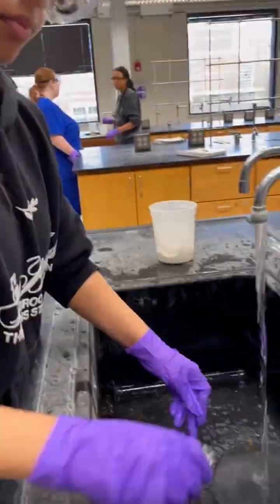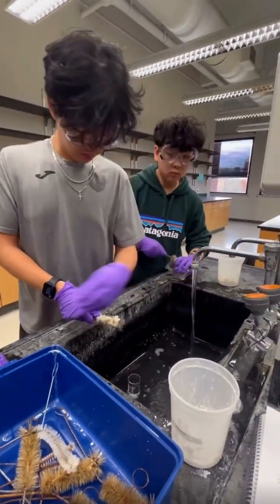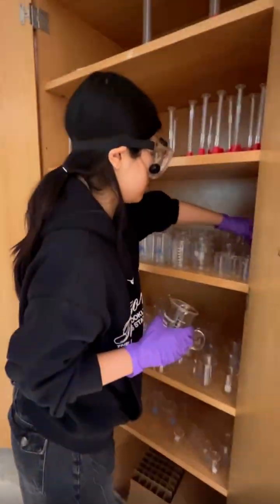Our solutions can safely be disposed in the sink. All the cuvettes and beakers are washed and placed back in their proper place before the lab ends.